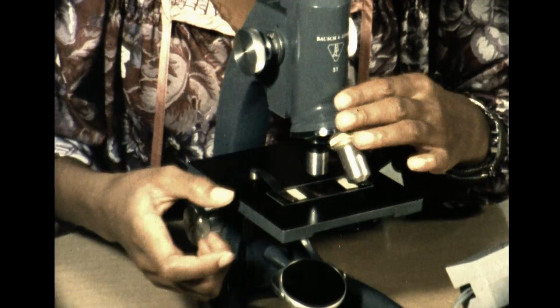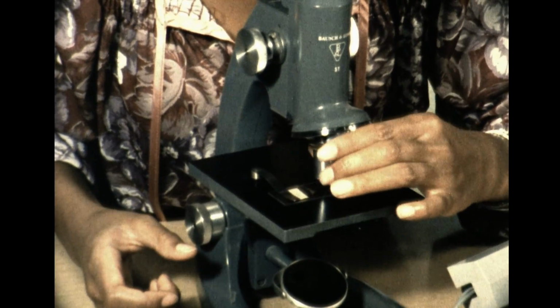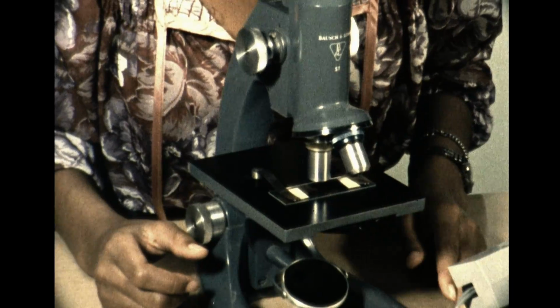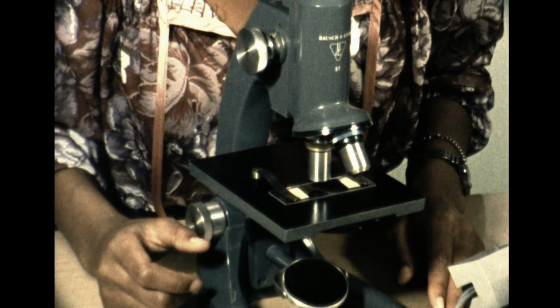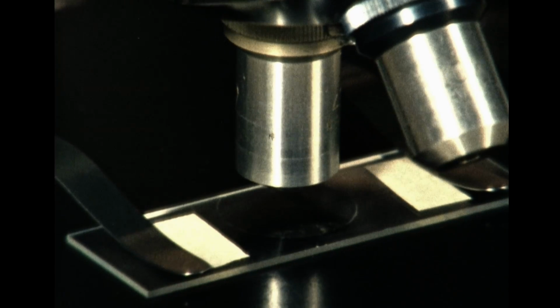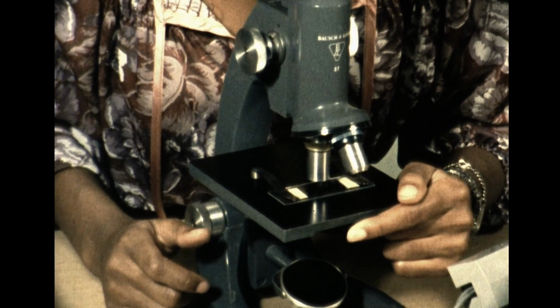12. The student puts the high power lens into position. Most modern microscopes are parafocal. If one of the lenses is in focus, so is the other. The high power lens is closer to the sample than the low power objective. Same hair under high magnification. The light intensity now is weaker. Opening the diaphragm improves the image.